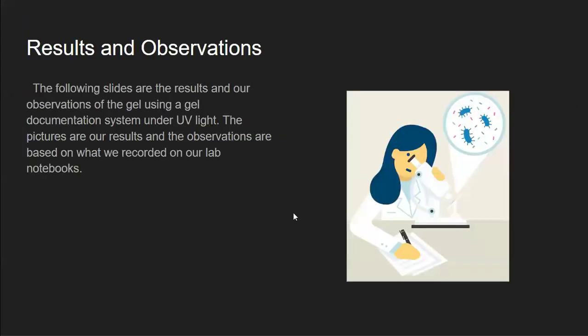Results and observations. The following slides are the results and our observations of the gel using a gel documentation system under UV light. The pictures are our results and the observations are based on what we recorded in our lab notebooks.